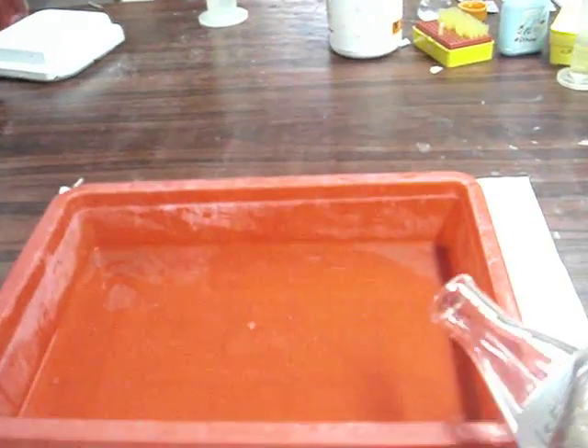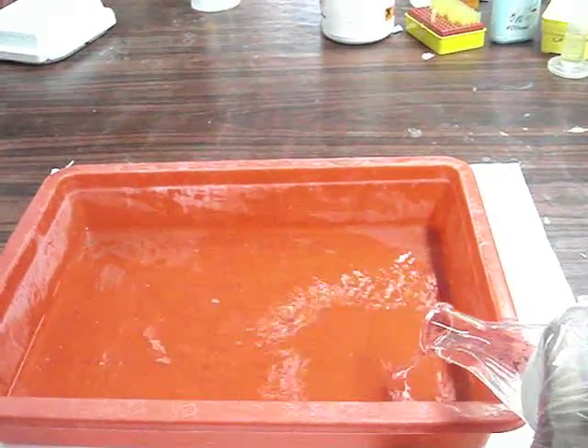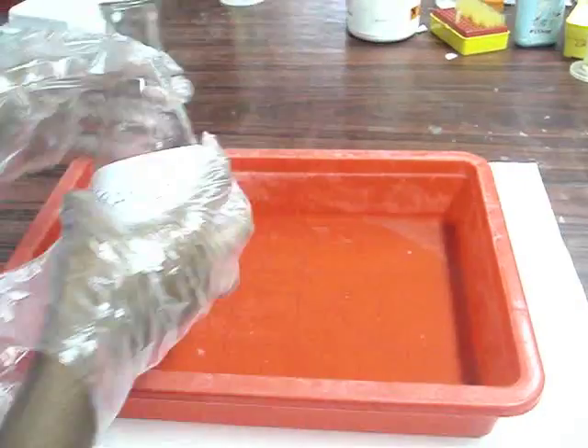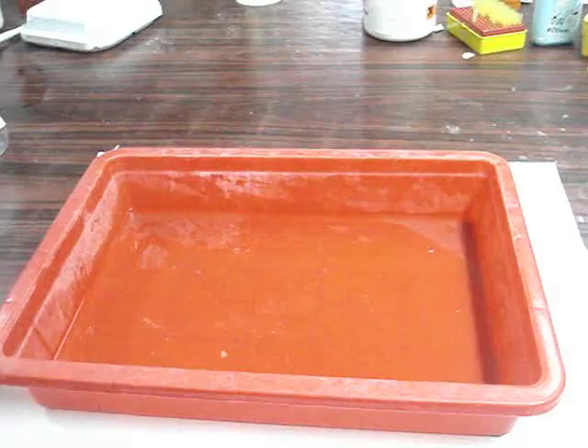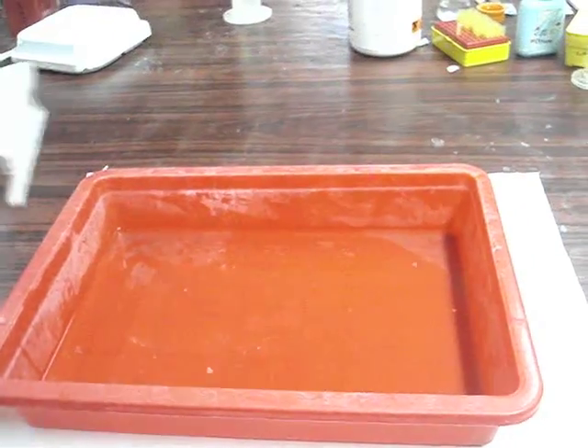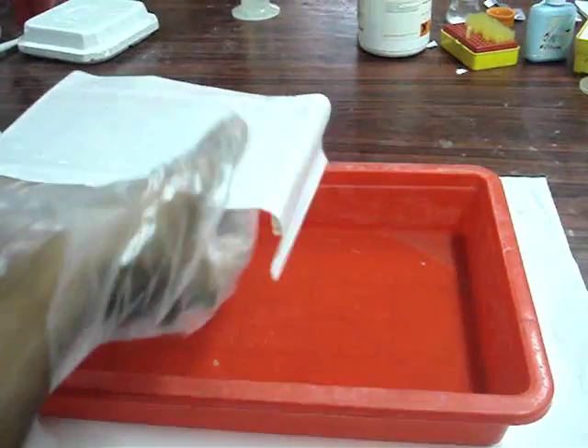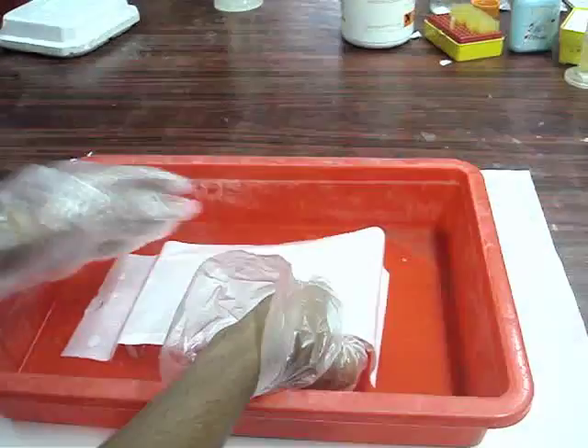Add 2 litres of transfer buffer to the reservoir. Place the Whatman filter paper over a support such that the paper comes in contact with the buffer solution.